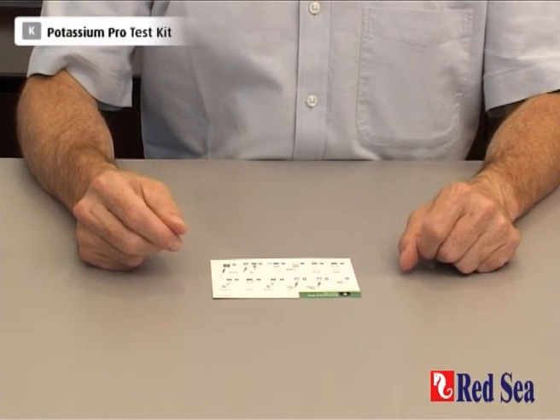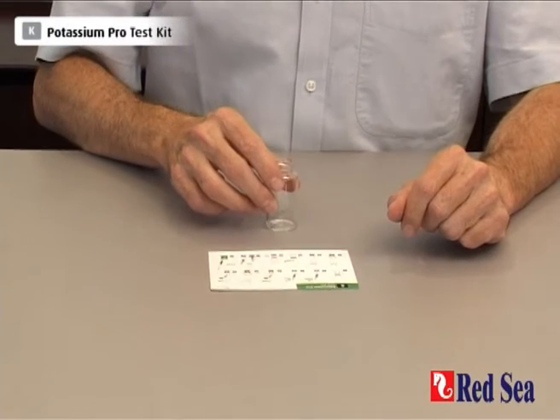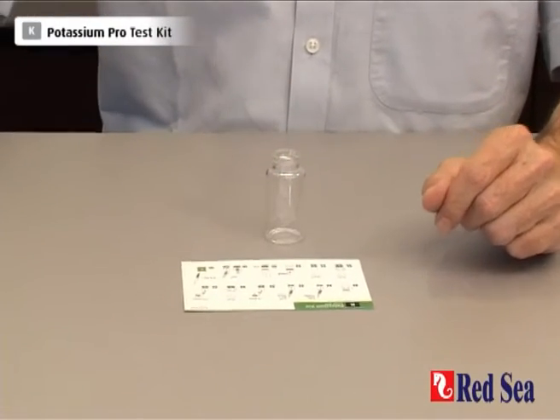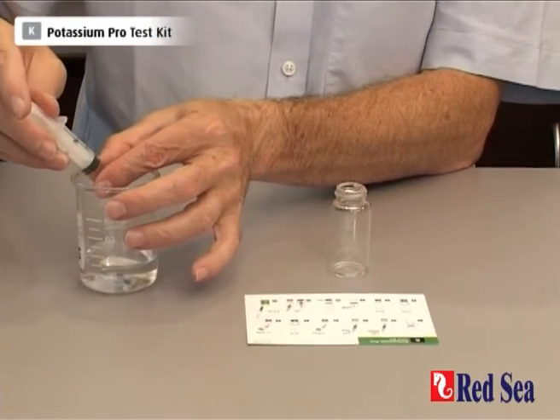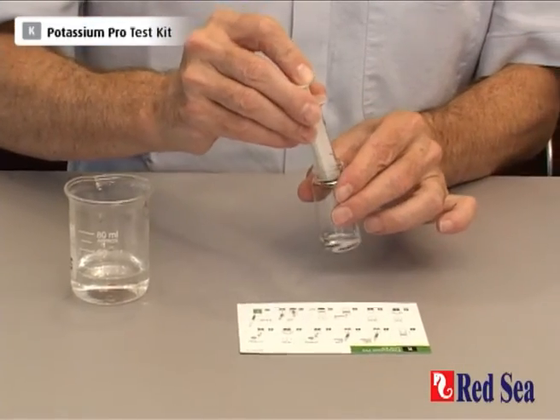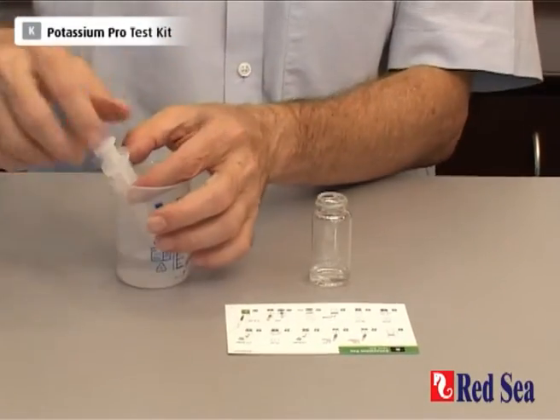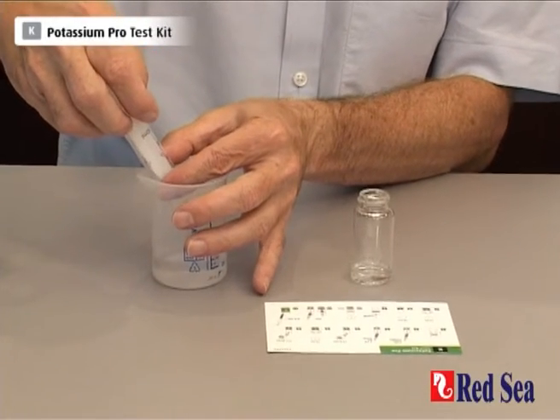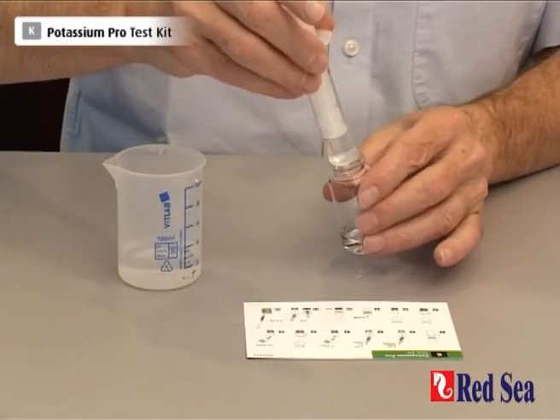The first part of doing this test is mixing 2ml of aquarium water with 3ml of RO water. Now let's do that — 2ml of our water sample with 3ml of RO water.